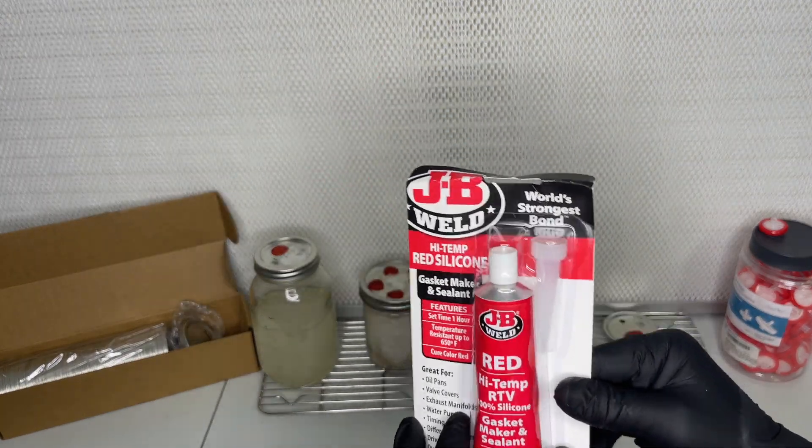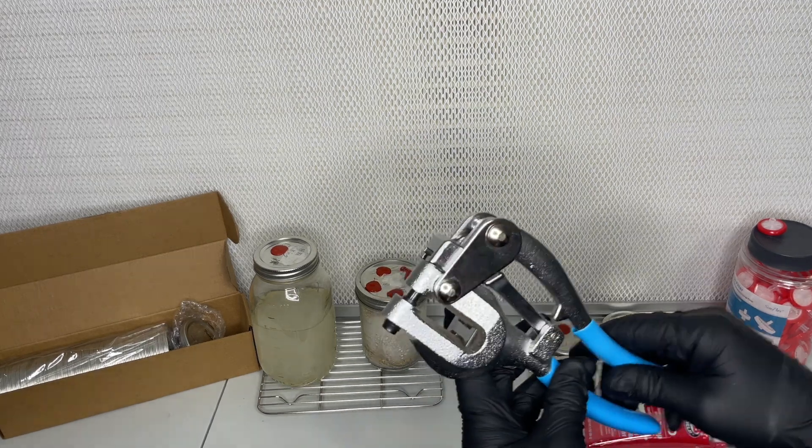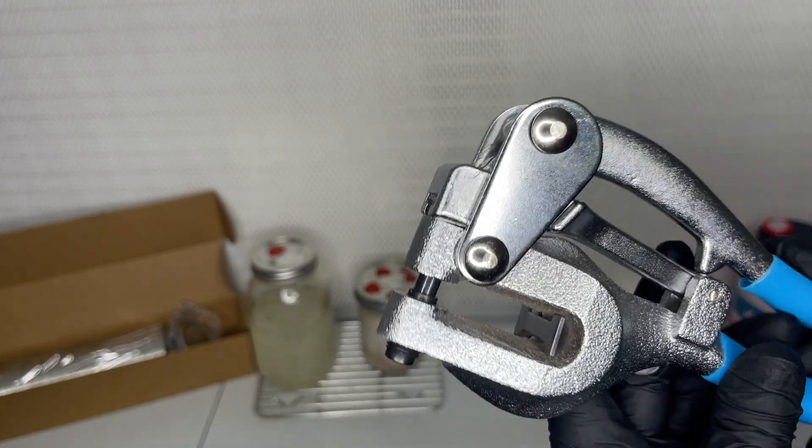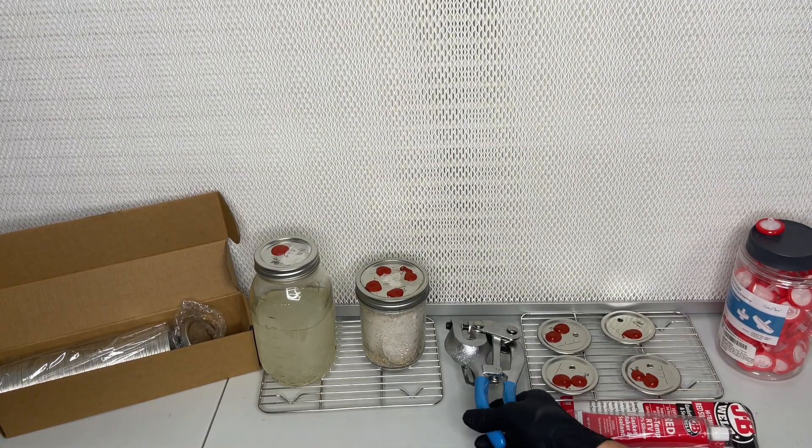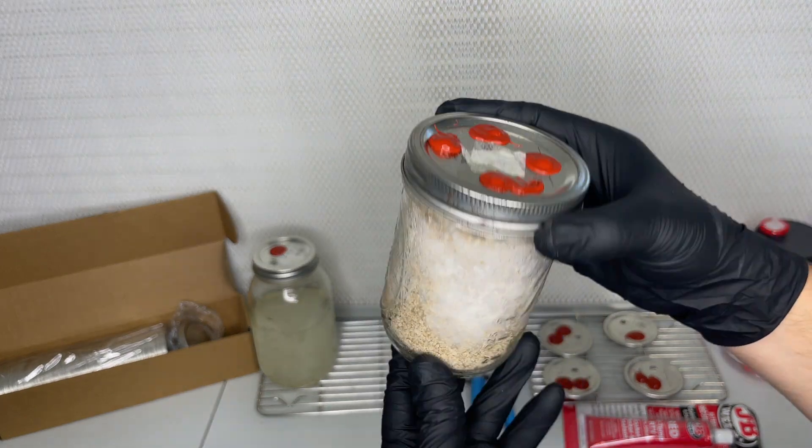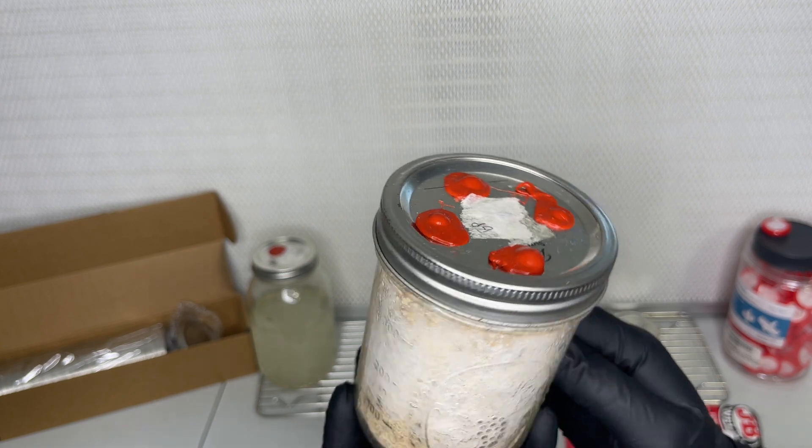This is the tube of high temp RTV silicone that I use for my injection ports, and this metal hole puncher comes in really handy when you're making a lot of lids. You can use the silicone on brown rice flour jars, liquid culture jars, grain jars, and even bags.